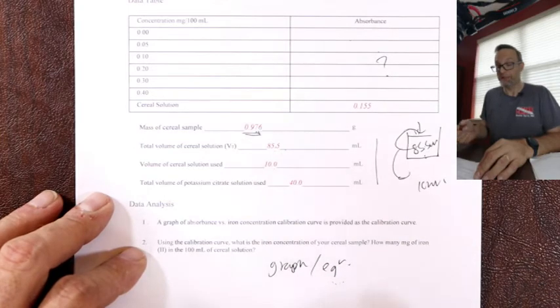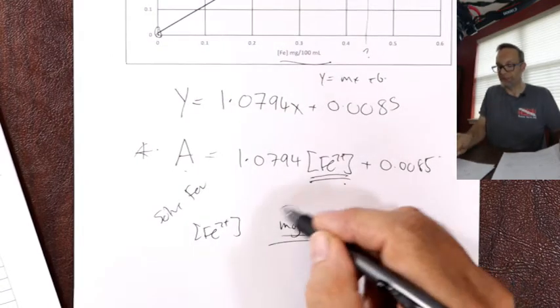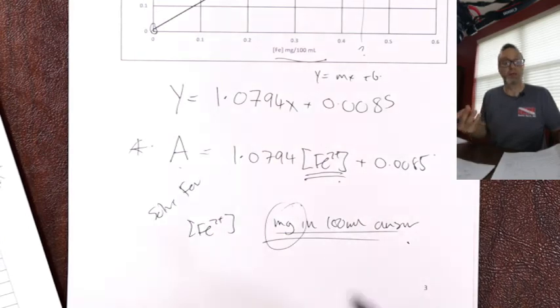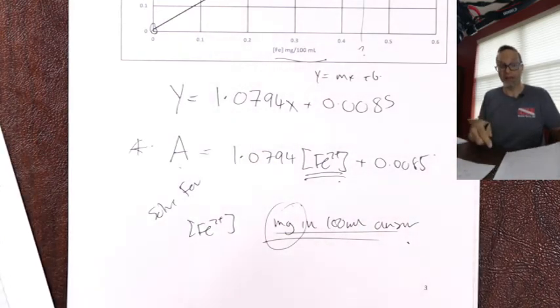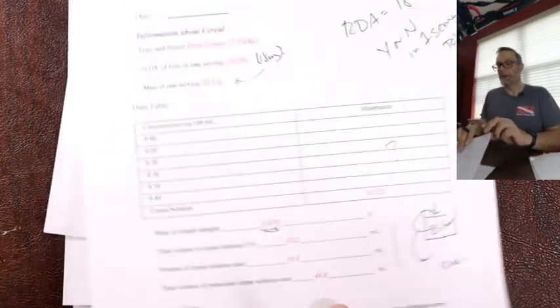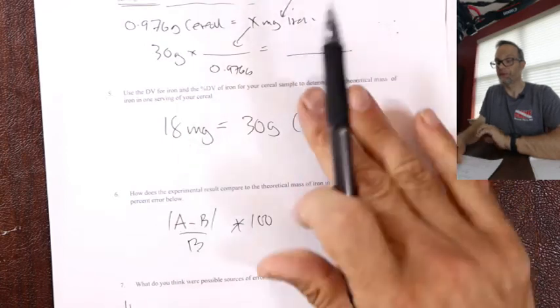You throw that in your machine and using the equation, you see what the concentration is, and just think about milligrams. Don't worry about that, that's kind of a reference. You work out how many milligrams are in that 10. Fair enough, and that's what you get here at the bottom. Then flip over. Well, actually, that 10 was taken out of a bigger volume.